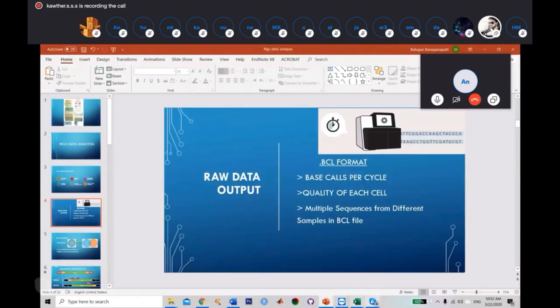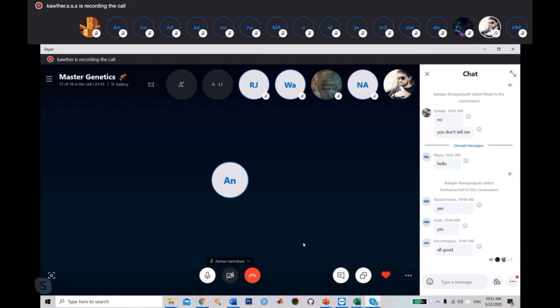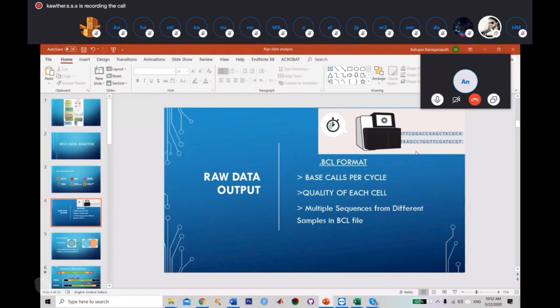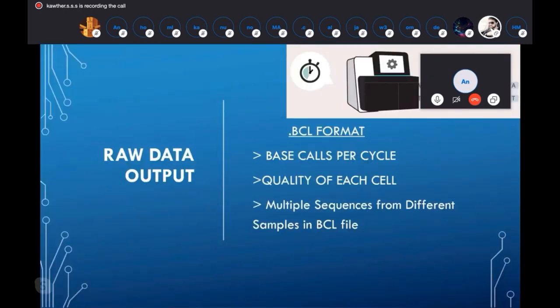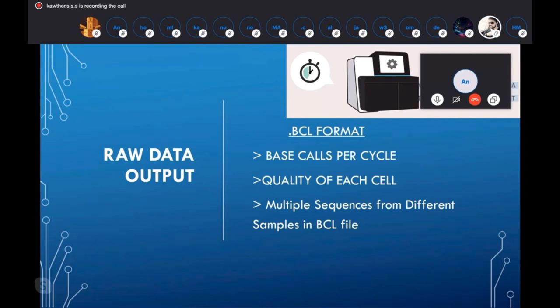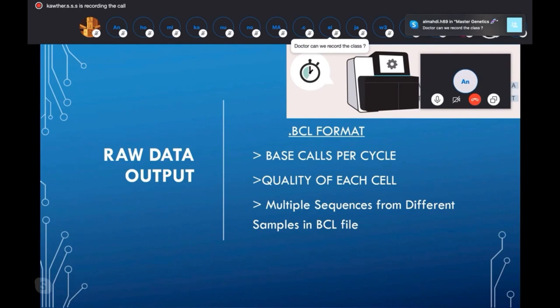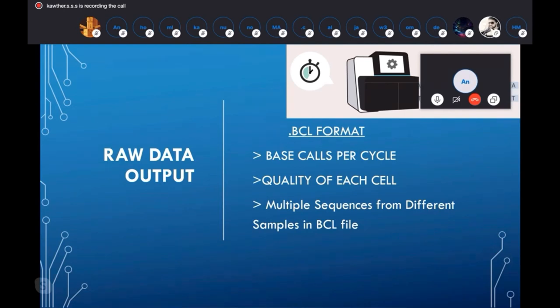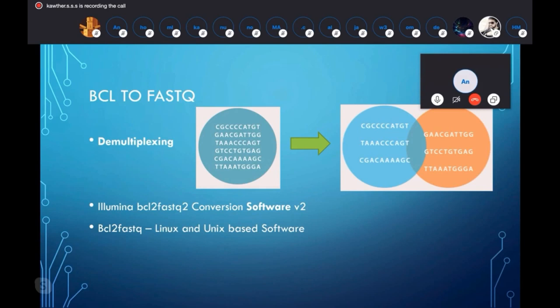The BCL format file contains multiple sequences from different samples in one file. So if you have 10 samples loaded in the machine, all 10 samples' information is stored in one BCL format file. Unfortunately, you cannot view this BCL format file directly — it is in a format that only the program itself can recognize. We have to convert it into a universally acceptable format file, which is called the FASTQ format file.